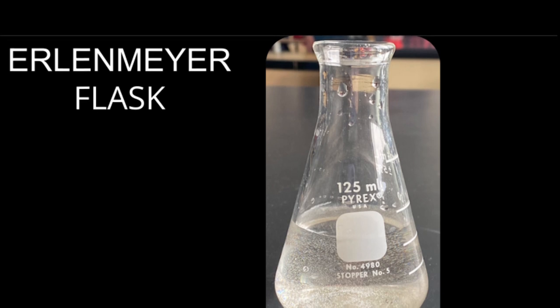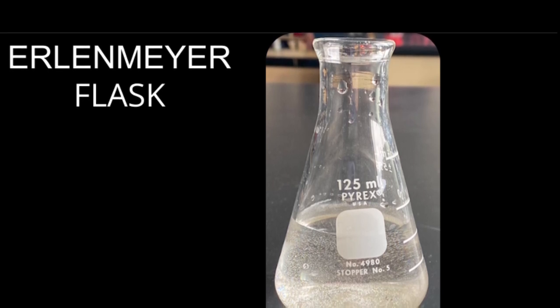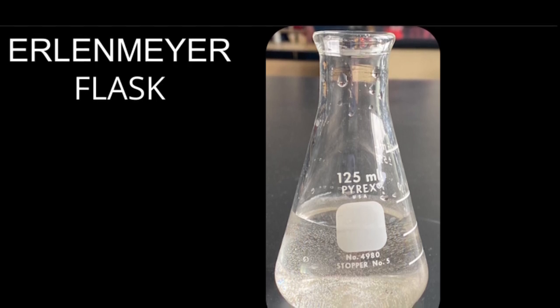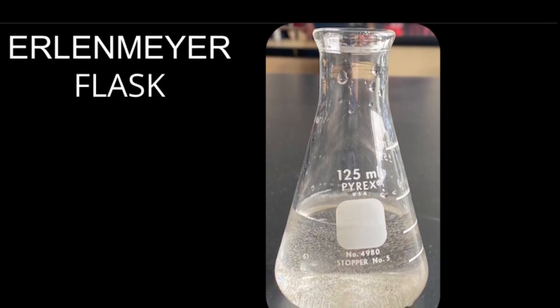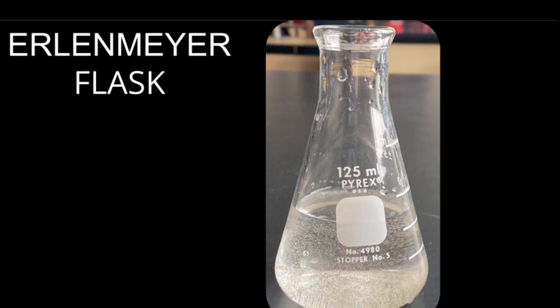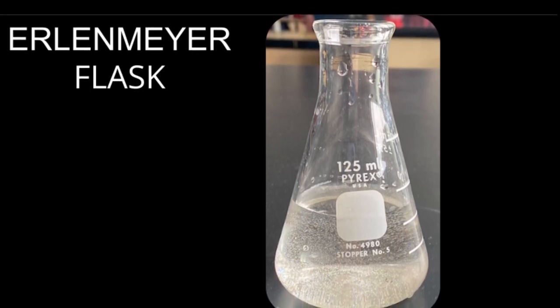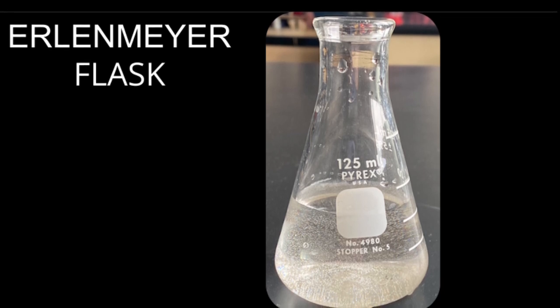An alternative to a beaker is an Erlenmeyer flask. A single flask ranges between three to a hundred dollars, which is similar to a beaker depending on the quality and volume of the liquid it holds. It is a type of chemistry flask. It has a cylindrically shaped neck and a flat bottom like a beaker. It also has measurement marks on the side, but it has a cone-shaped body.